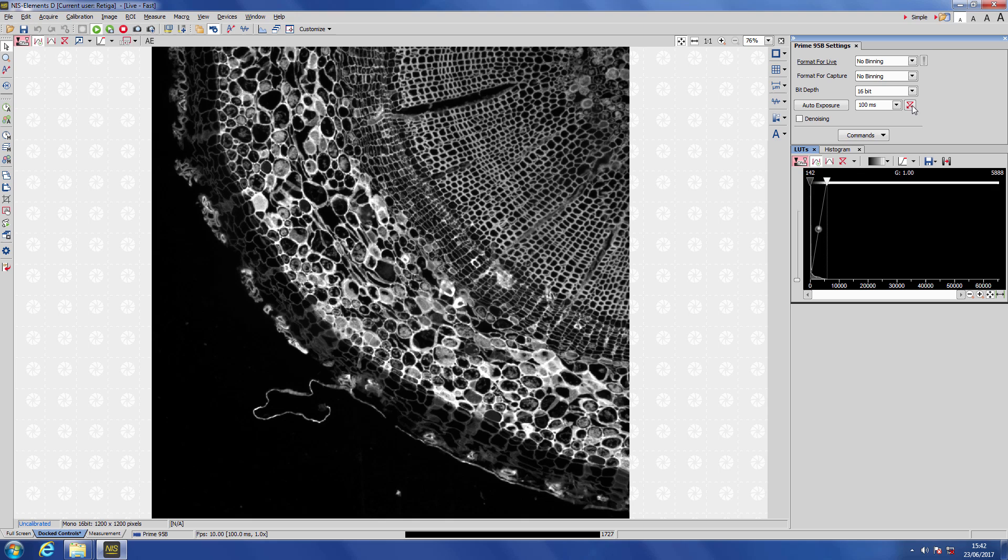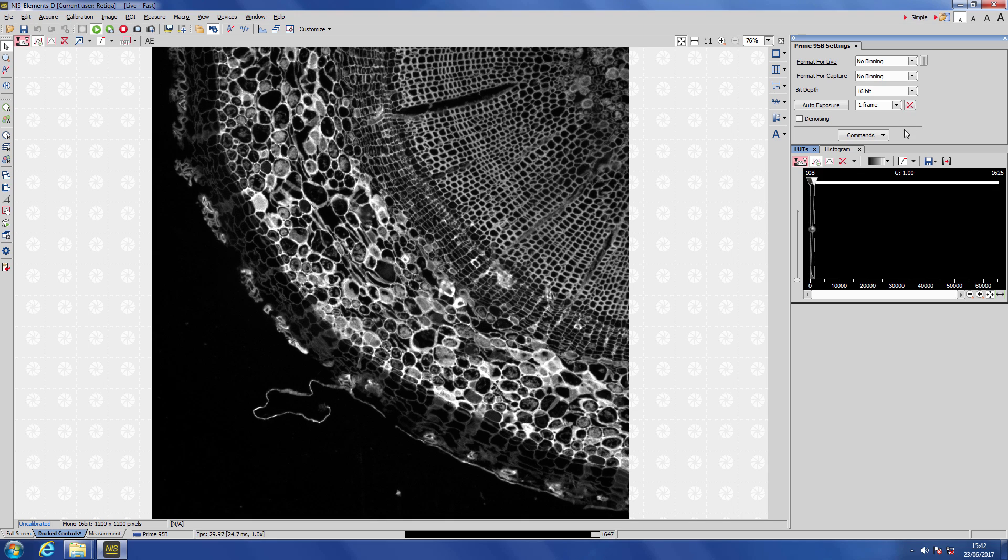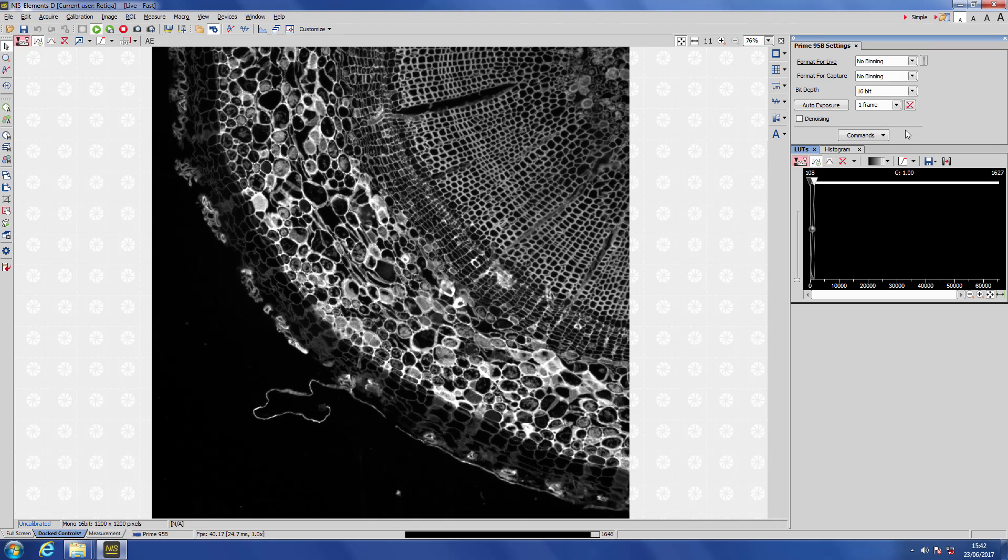And finally, we can just click this button to use the maximum exposure time that still gives us the full frame rate of the camera.